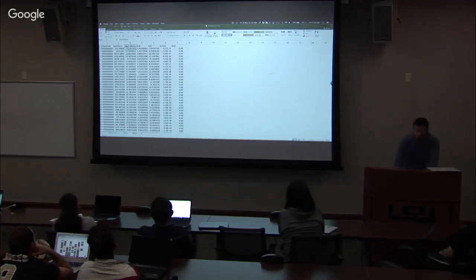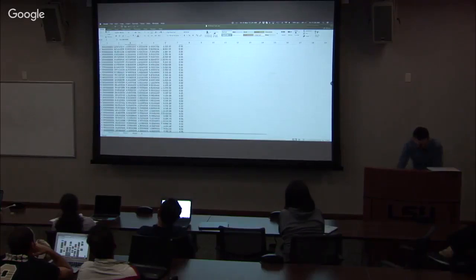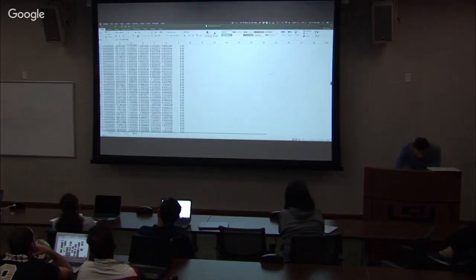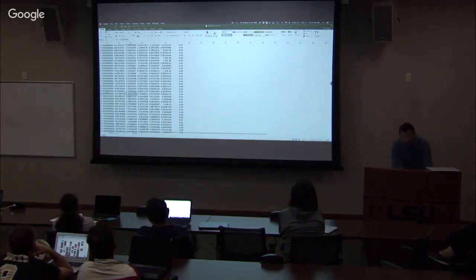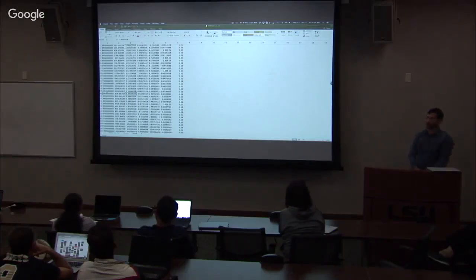So 13 would be the fold change between those two groups. And let's say I will go to a minimum of 1.5. I'm not really interested in anything below that. So let's say 1.5 will give me about 931 genes that have a difference, right?